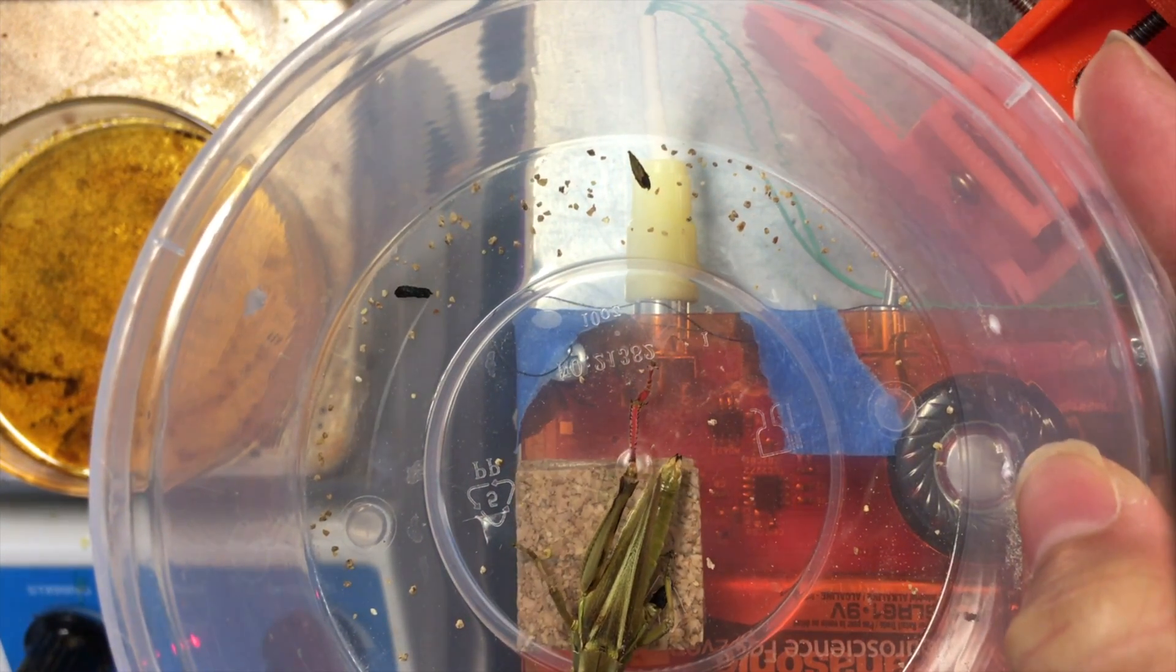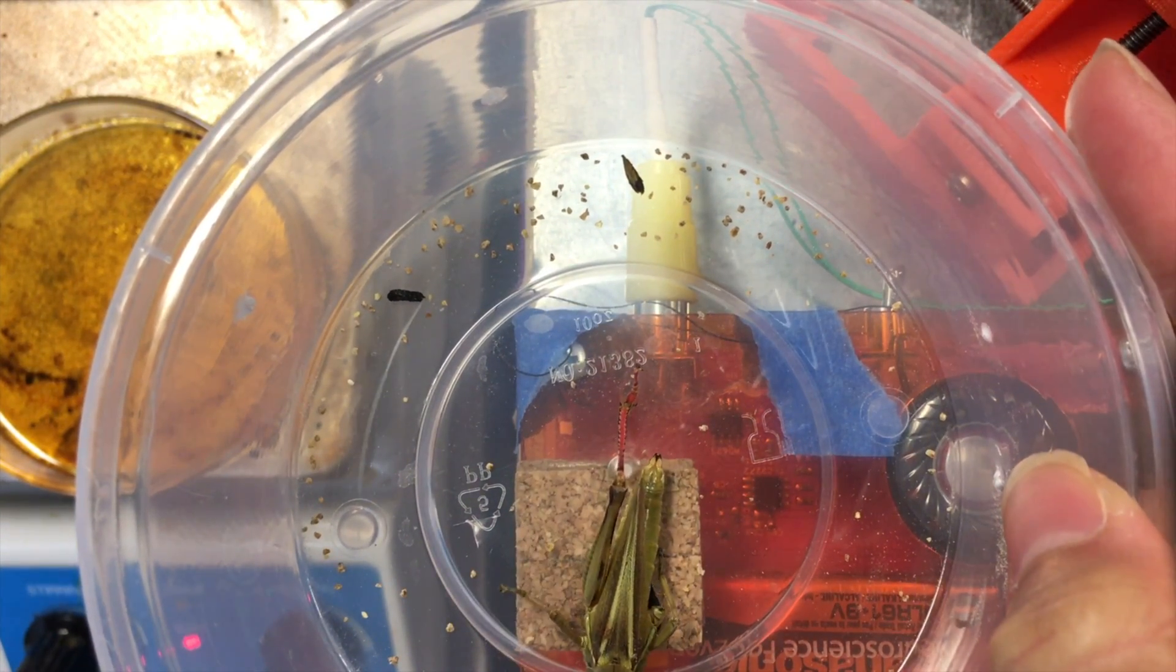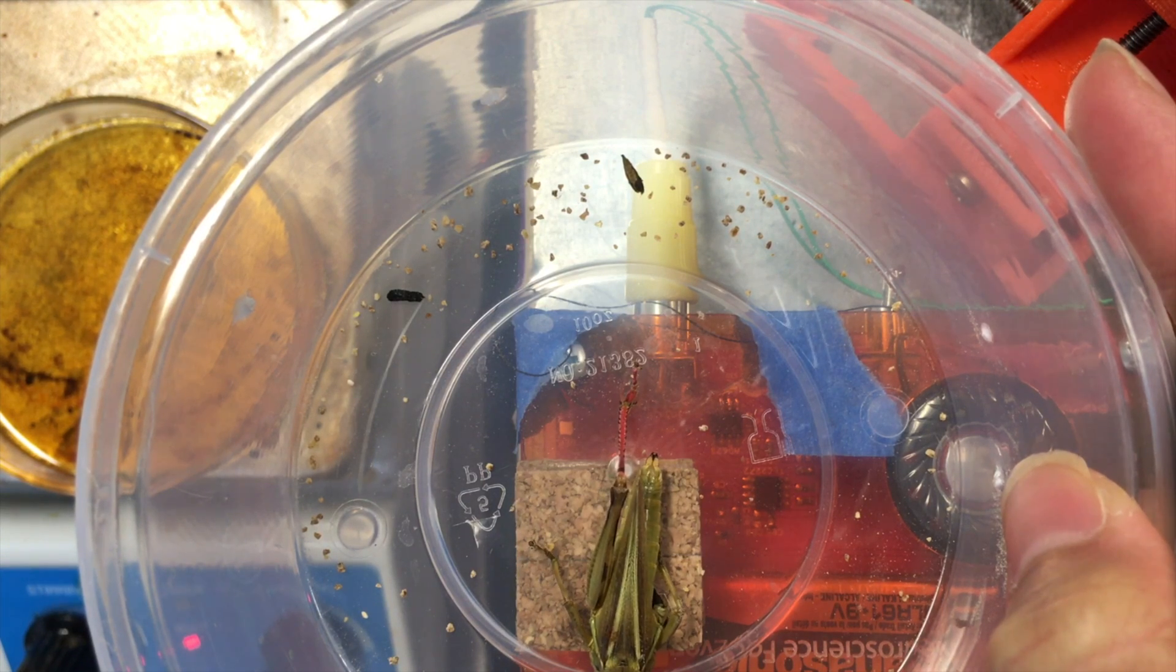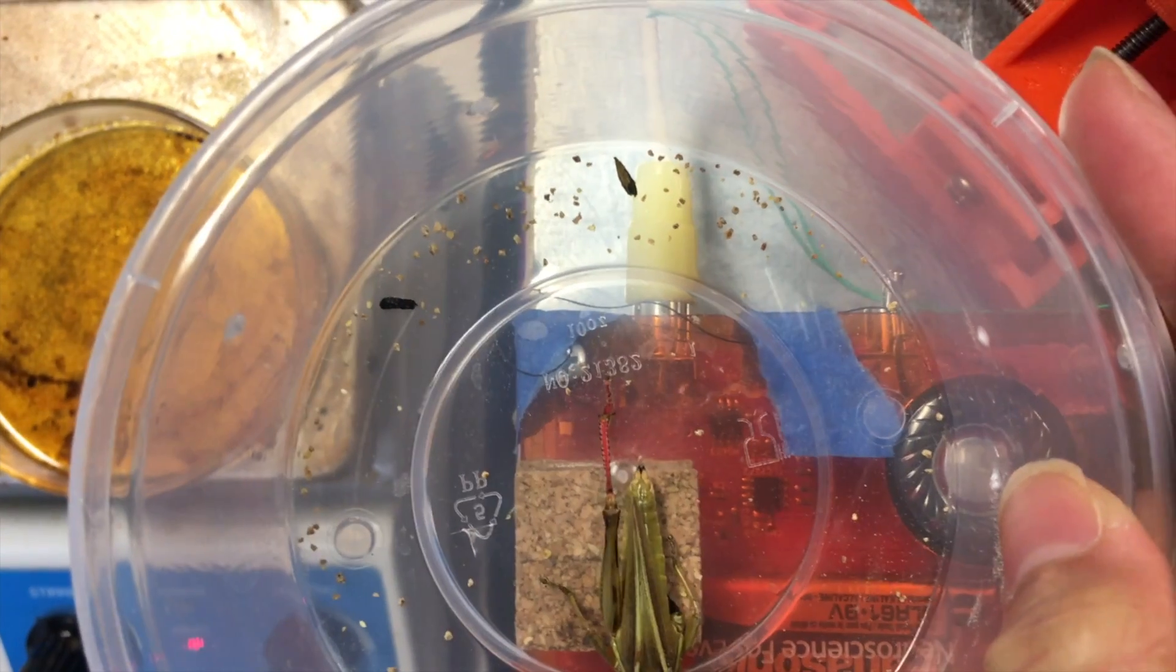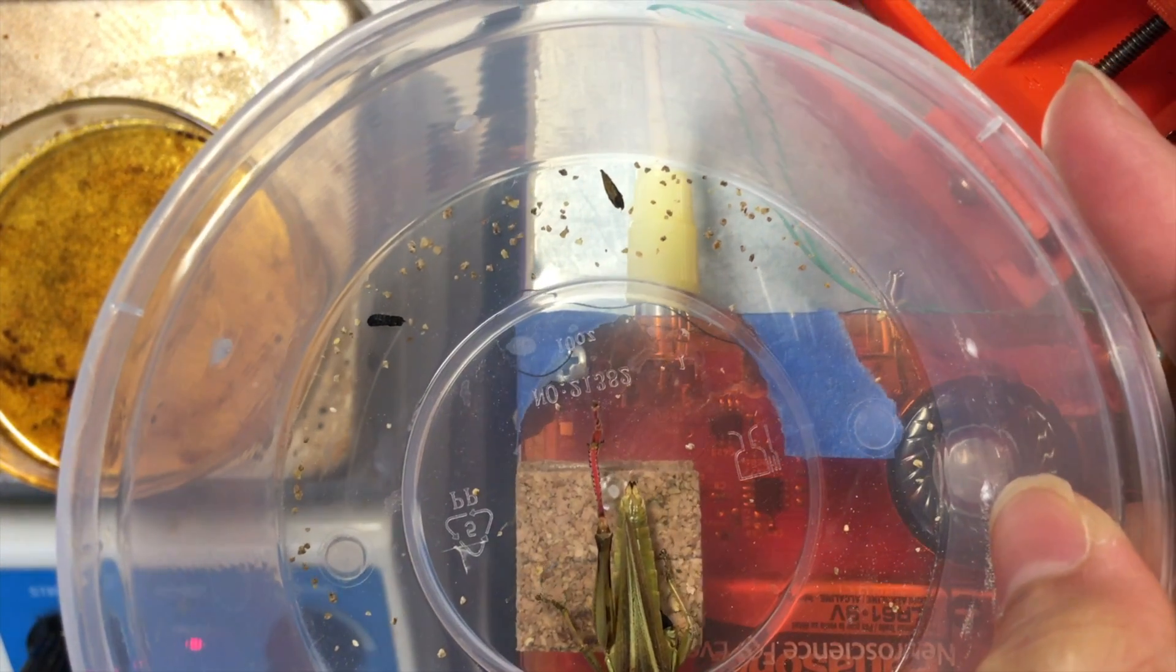This neuron receives visual information from the eyes and then sends the information to the motor neurons and activates the leg muscles, so that the grasshopper can see an approaching object and jump away to avoid colliding with it.